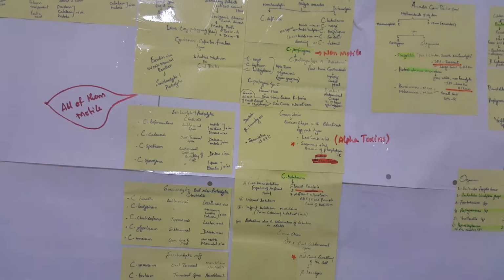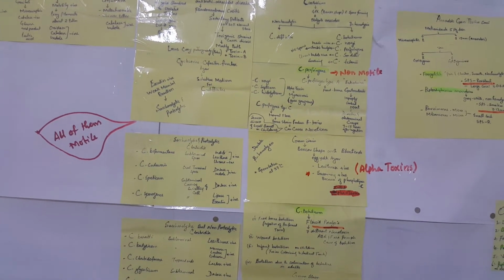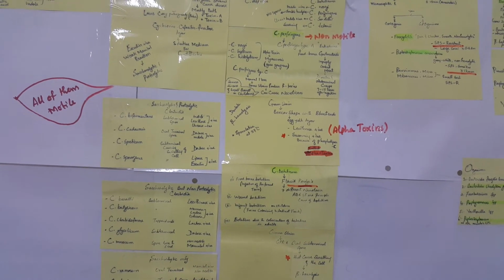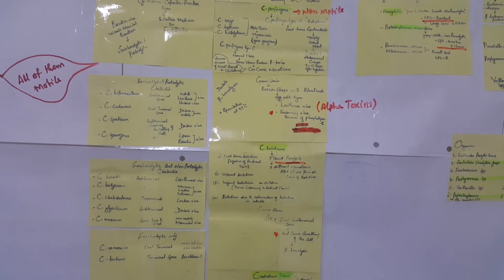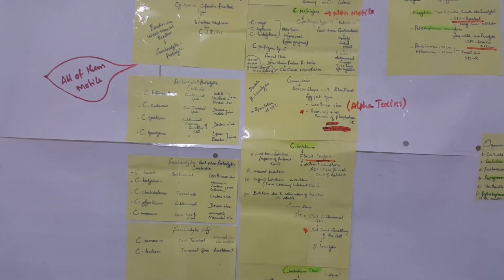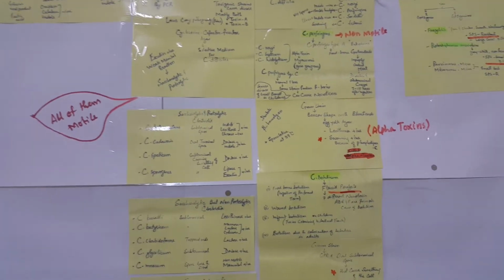On the gram stain, if we see, there are three organisms: Clostridium novyi, Clostridium septicum, and Clostridium histolyticum. They are able to produce alpha toxins. Alpha toxins are basically lecithinase production. All of these three are lecithinase positive, and that's why they have the ability to produce alpha toxins. Swarming is another ability of this group, and that is because of phospholipase C. This bacteria sporulates at 37 degrees centigrade, and the double hemolysis differentiates Clostridium perfringens from all other Clostridia.